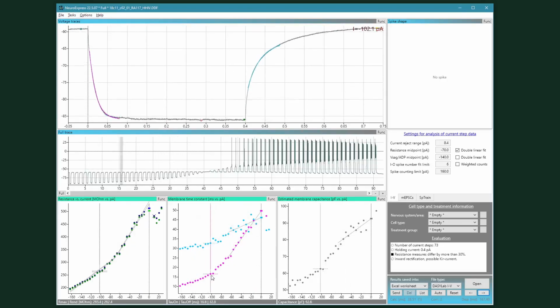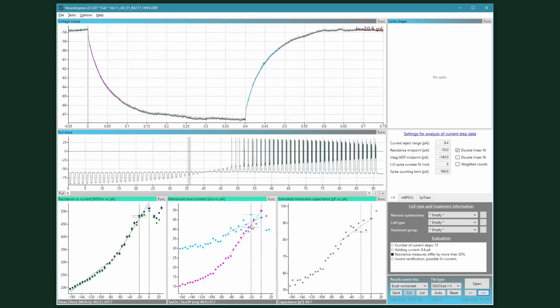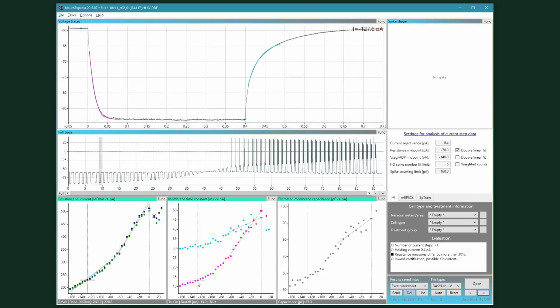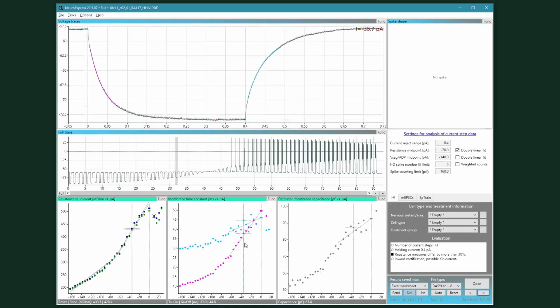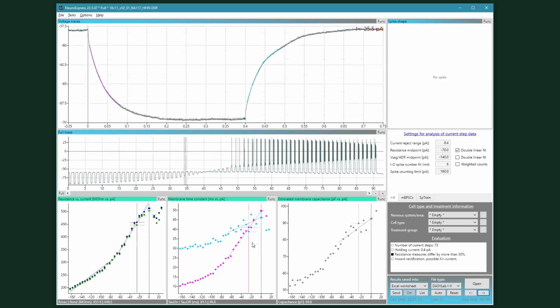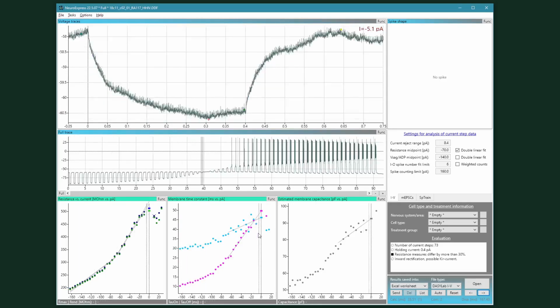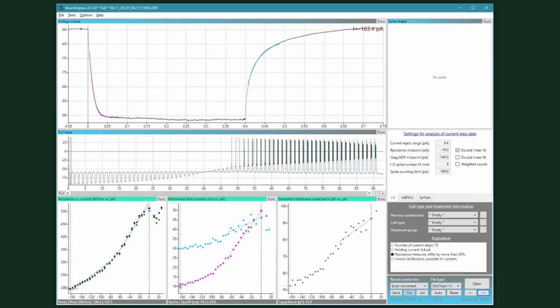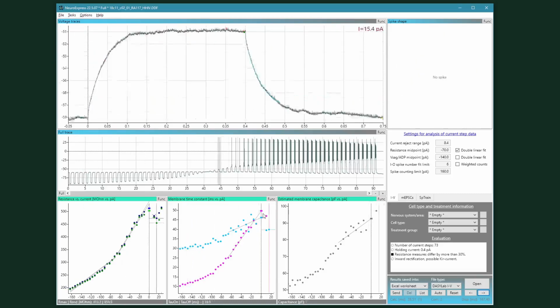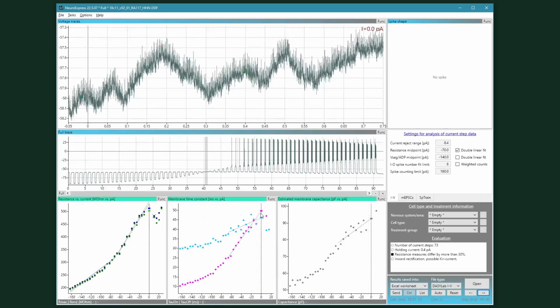These magenta points depict the estimated time constant for the particular voltage trace, and they also depend on the injected current. There can be a huge difference between the most hyperpolarized responses versus the response very close to I equals 0. In this example, the time constant ranges from 10 to 45 or even 50 milliseconds.